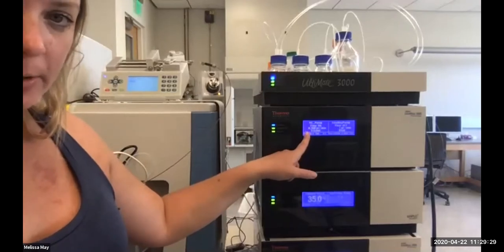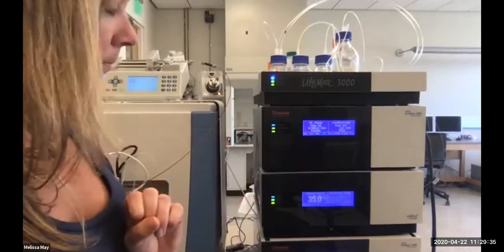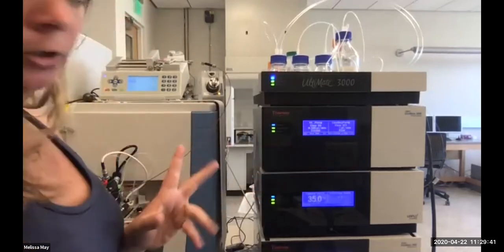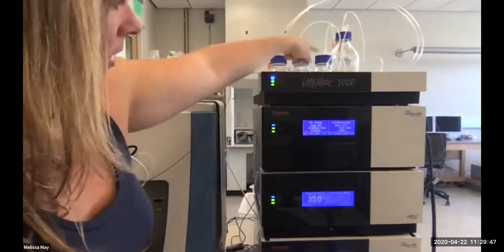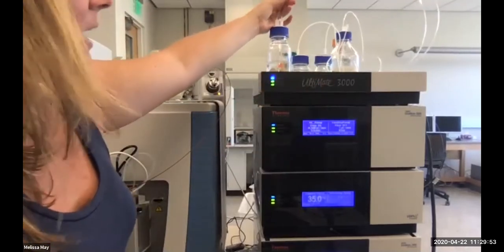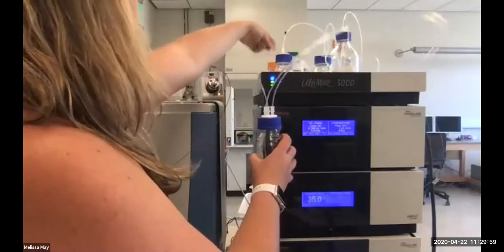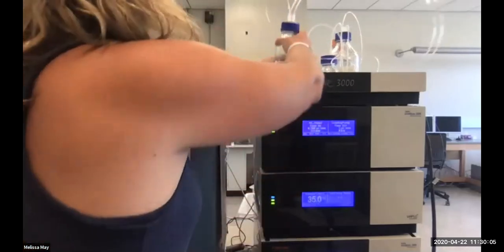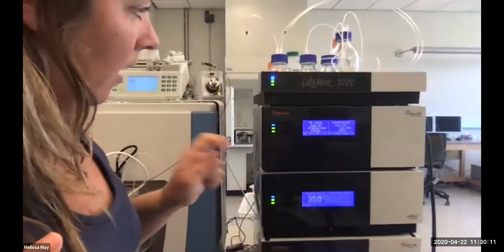I can see what my pressure is, so it's stabilized at 316 bar. My loading pump doesn't have any pressure because it's not on. And then I can also see the percentage of each tube that I have coming in. So I have solvent A at 96%, solvent B at 4%, and then as I mentioned before, for my loading buffer, I have all three lines, A, B, and C. You can see they have little tags on them telling you which line it is. So this one's A, this one's C. I know you probably can't see that from there. And like I said, I just have this running as 100% A.